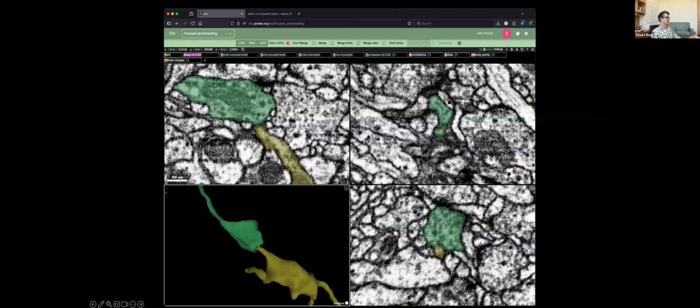We offer them up here, and they churn through hundreds to 1,000, let's say, in a day. There's a related idea here, but here we're not asking if things should be merged together or not. We're reviewing zebrafish synapses to be used as ground truth for training a model. We can ask if this is a good synapse, bad synapse, or false prediction.